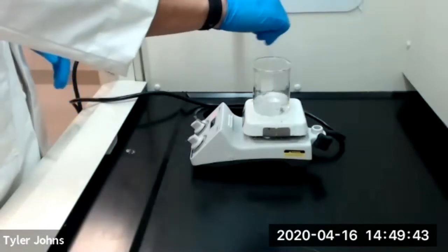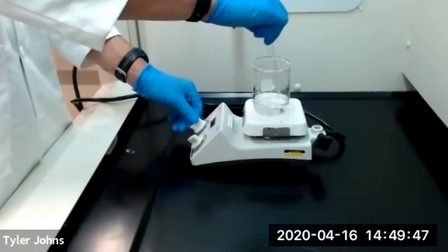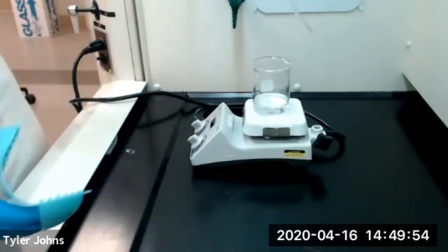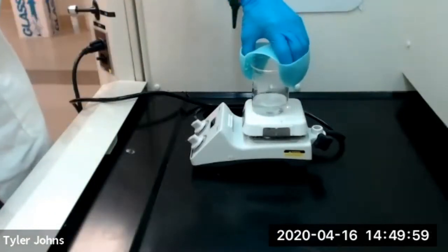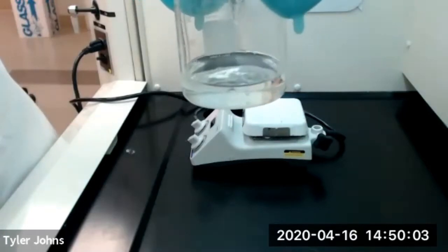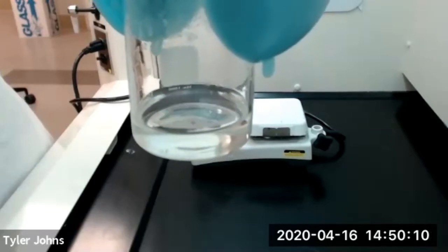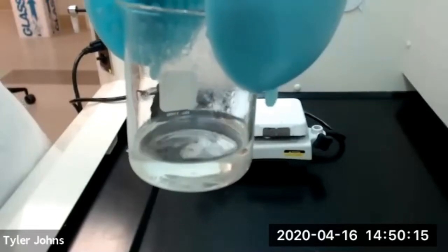At this point we've been heating our solution gently. I'm going to turn off the heat because we've now significantly reduced the volume to about 45 milliliters and we have a nice clear solution. We're going to go ahead and place this in tap water to get it cooled, and then we're going to set it in an ice bath to induce crystallization.